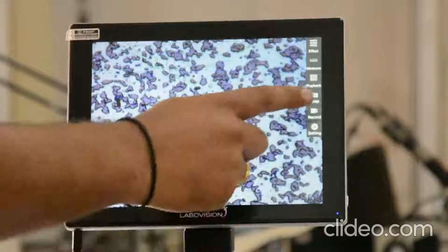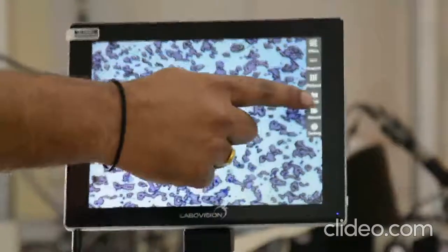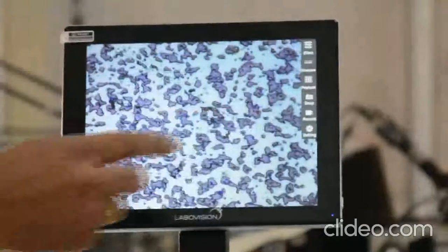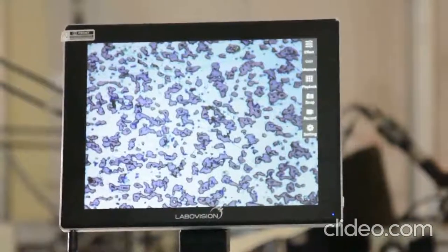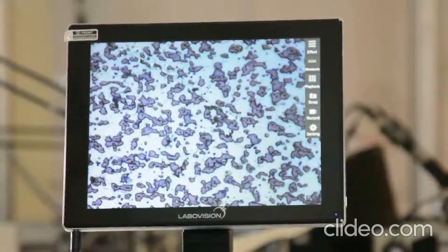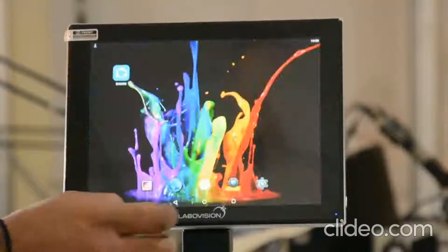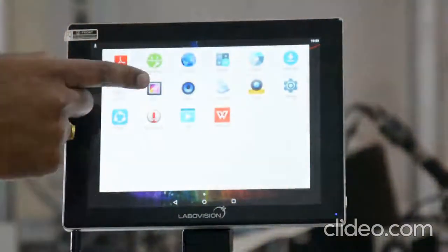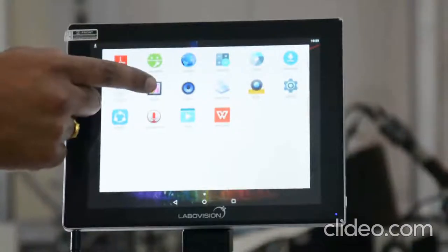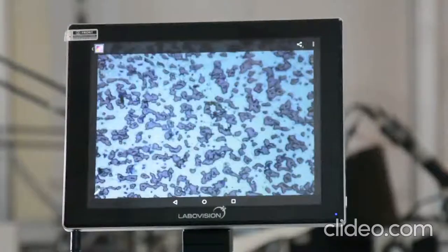Now we will show you the capturing of the image. Now image has been captured. If you want to view the image, slide up. Go to the image folder. Now you see this is the photo folder, just like an Android. Click on the photo folder. Now this is your current image which has been captured.